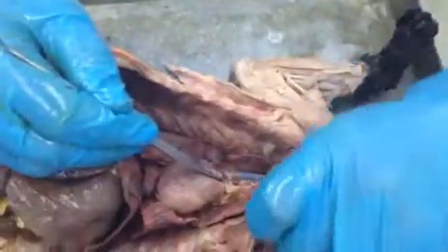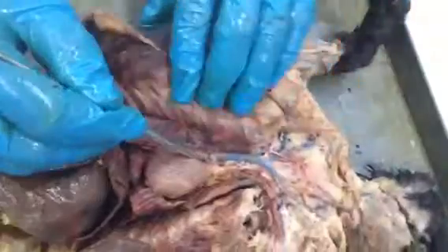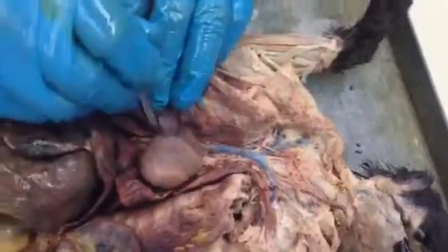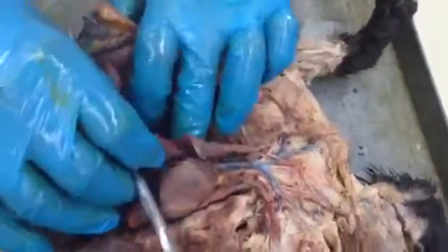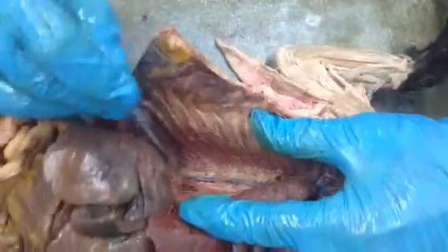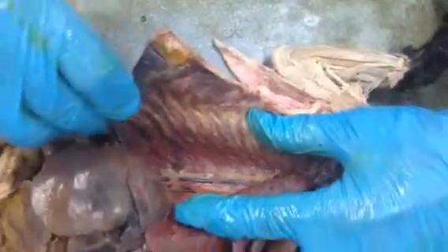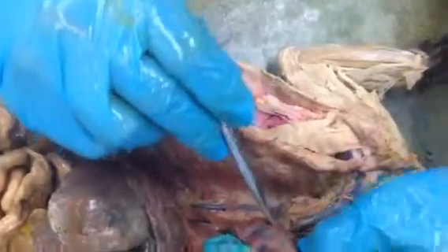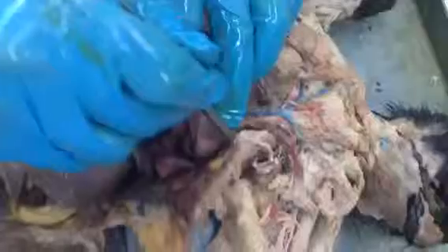All right. Then on the superficial vessels coming from the anterior region, the head region, superior vena cava, and if we move the heart and lungs to the animal's left, we can see a major drainage of the chest region known as the azygos, and we can see several branches from the upper ribs. That's the azygos.